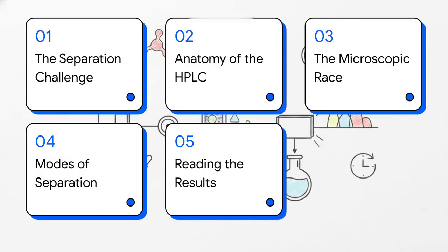Okay, let's dive into this. Here's our roadmap for today. 1. The separation challenge. 2. Anatomy of the HPLC. 3. The microscopic race. 4. Modes of separation. And 5. Reading the results.